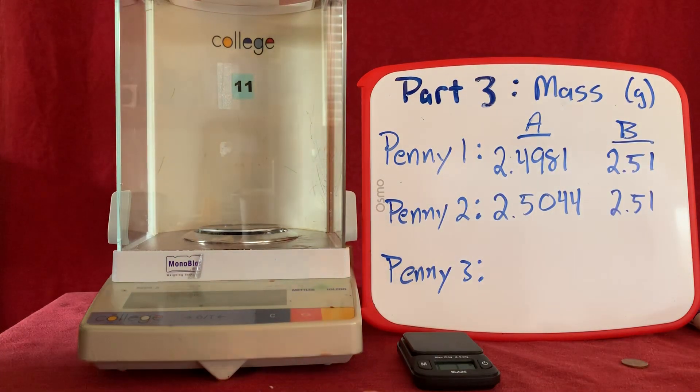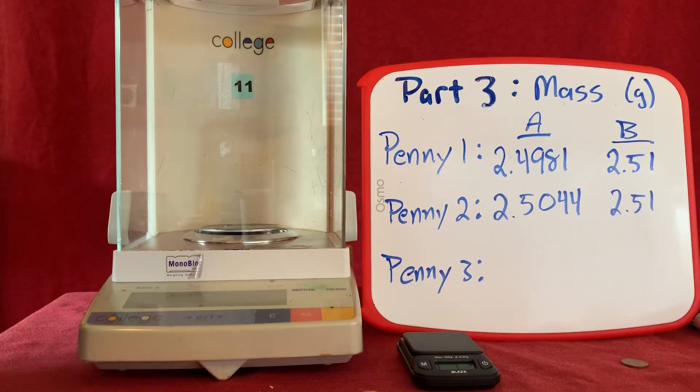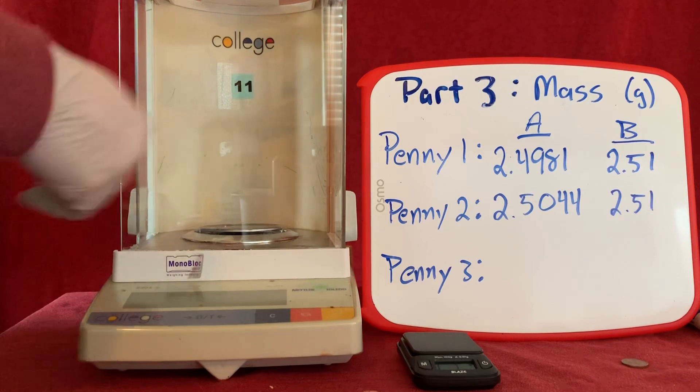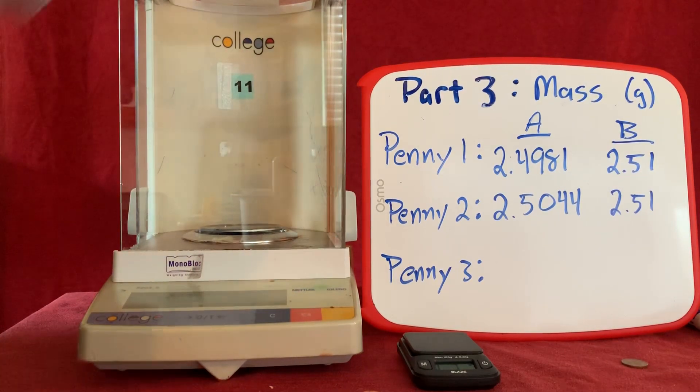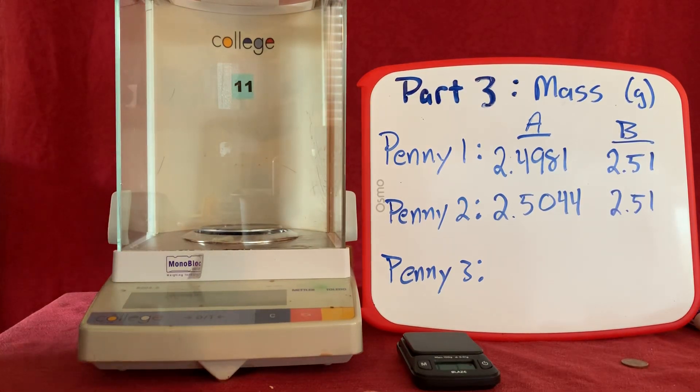Let's take a look at penny three. Now to use the balance, the first thing I want to do is make sure that it's clean and clear of any other items in the balance area. We have a few different doors that we can open and close depending on what it is we're trying to load into the balance. Whenever we're taking a measurement, we want to make sure all those doors are closed.